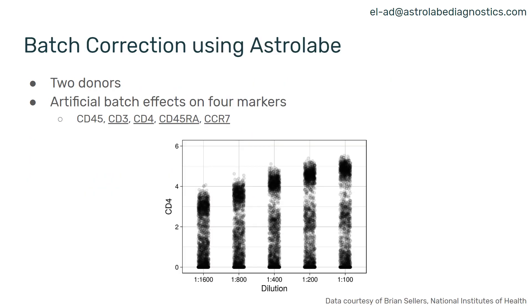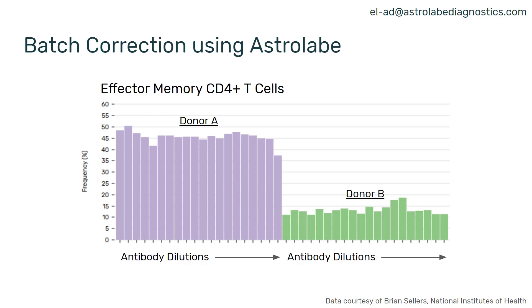I want to talk about batch correction using Astrolabe. We took the full dataset from Brian Sellers at the NIH, which has two donors with artificial batch effects on four markers — two donors and 16 conditions per donor — and ran it using Astrolabe. What we see is the frequency of effector memory CD4 T-cells in each donor: purple is donor one, green is donor two, and the x-axis shows the dilutions of the different antibodies. Astrolabe faithfully recovers the frequency of effector memory CD4 T-cells across all samples. There's no magic here — this uses the exact trick I mentioned, where Astrolabe clusters and annotates each sample separately and then combines them for follow-up statistics.